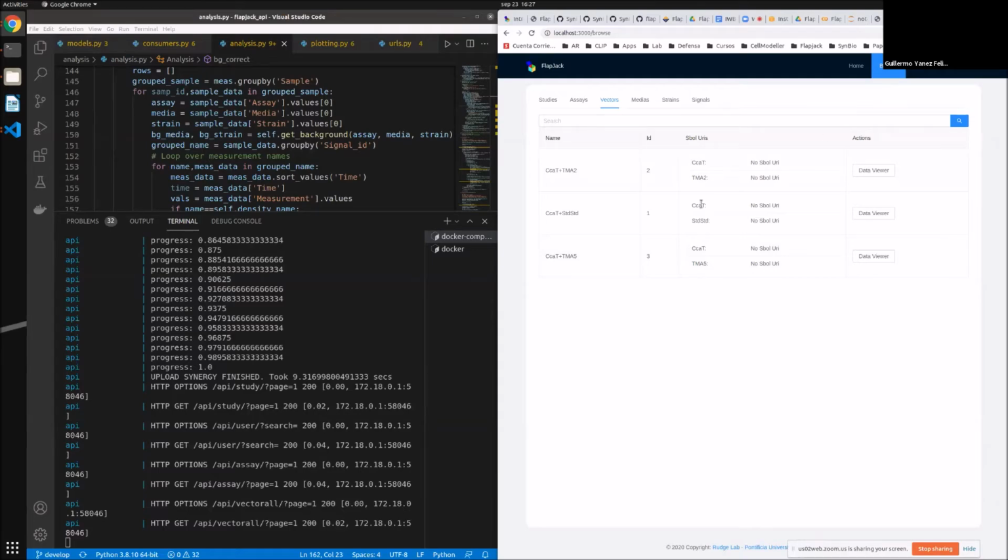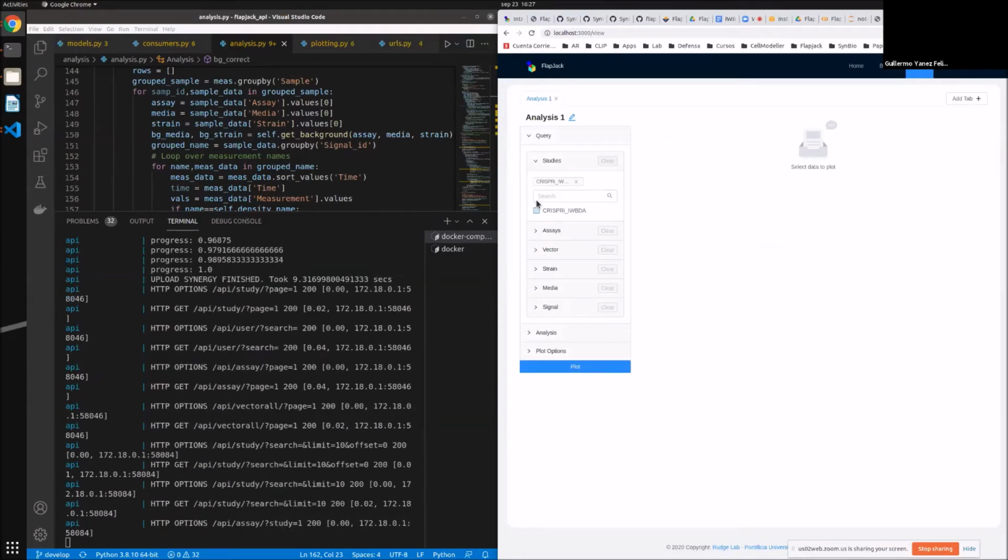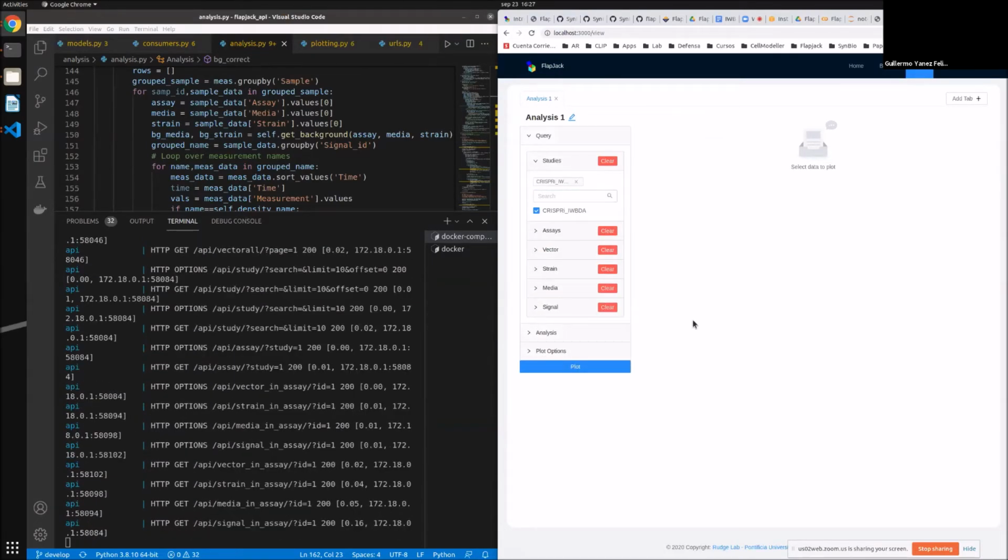We were pretty happy when we implemented it, but the problem, and this is anecdotal, was that the whole backbone was represented. So you have a small transcriptional unit and the whole backbone going to the right. So, next time. And then in your local instance, you already uploaded data, and we can perform some queries, some analysis.